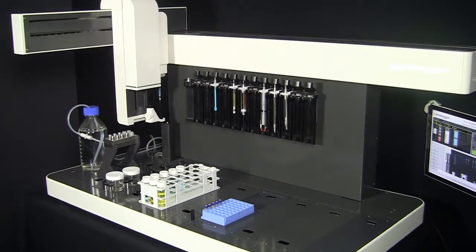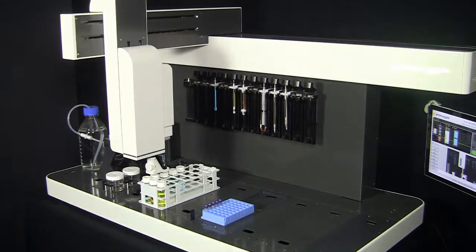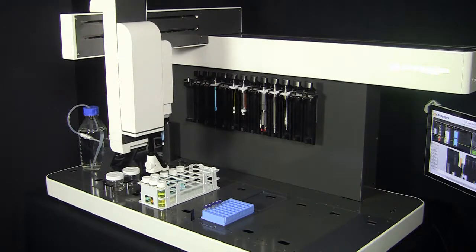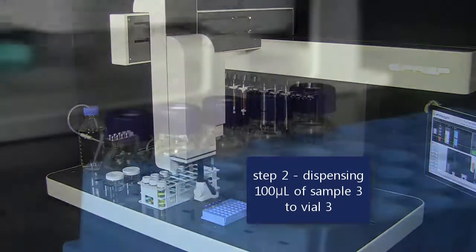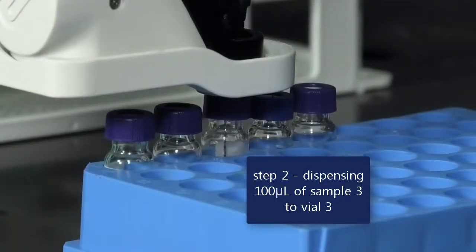We can now see the ePrep in operation. In this video, we shall skip the syringe washing and syringe changes, as this would take too long to view, but these will be executed nonetheless as part of this workflow. We pick up the workflow after vials 1 and 2 have been completely finished with all components added. Also, the diluent has already been added to vial 3. The ePrep is now executing the second task, which is the addition of 100 microliters of the sample to vial 3.